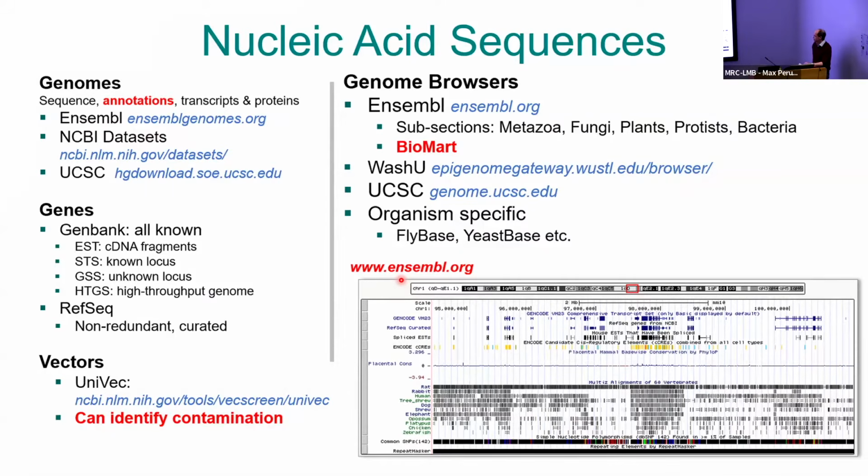For data deposition for vectors, you could go to UniVec. This is a good resource. It has vectors, primers, linkers, that sort of molecule. You may be wondering why you'd be interested in that.